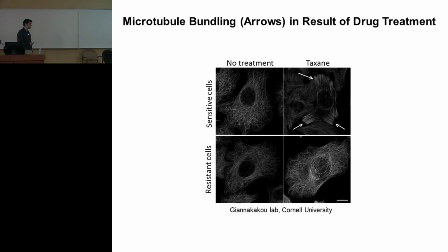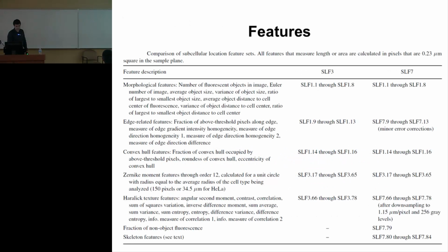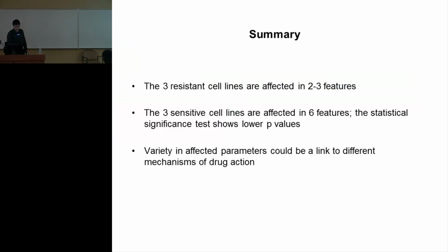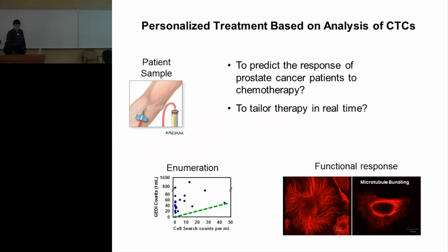Can the doctor give that number by looking at the images? No, they don't have a way. They just look. They can look at the images, but if you think about a screening with many cells, many patients, that becomes very difficult for a physician.